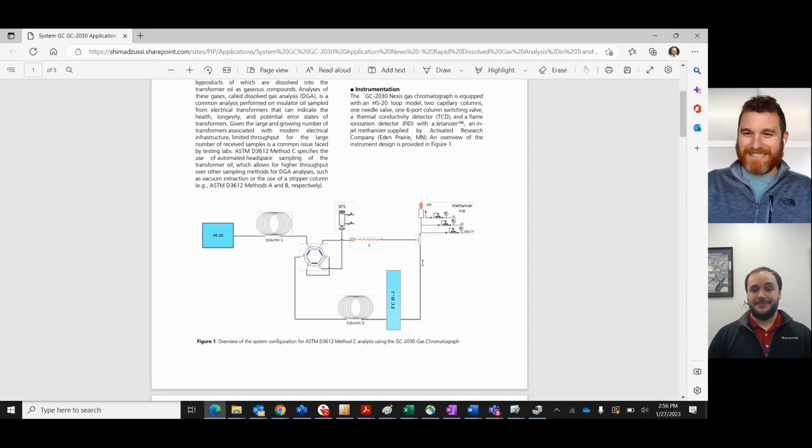Well, we love to hear that. We try to make a good product, but of course you never know until it's being used in the field, so that's always great feedback. And I love that you minimize the valving, because honestly, I think valving problems are the single worst issue to deal with in the GC world, especially when you get out into the field and are trying to diagnose the timing and things like that. So that's fantastic that you've been able to remove that.